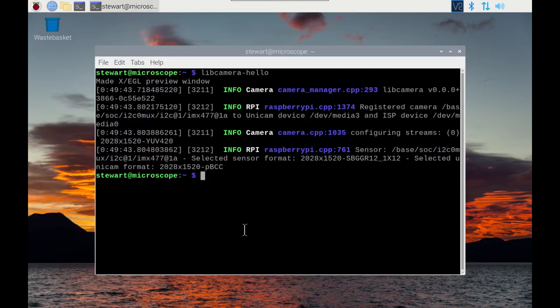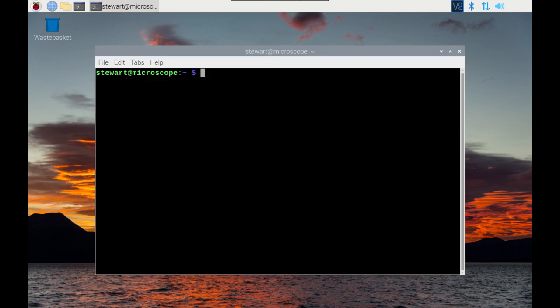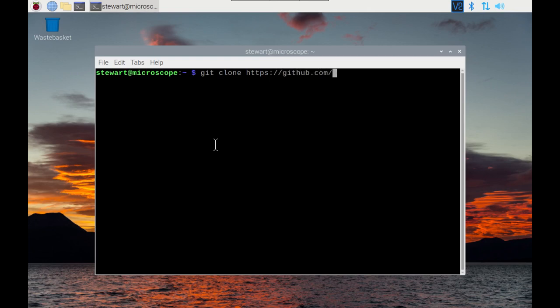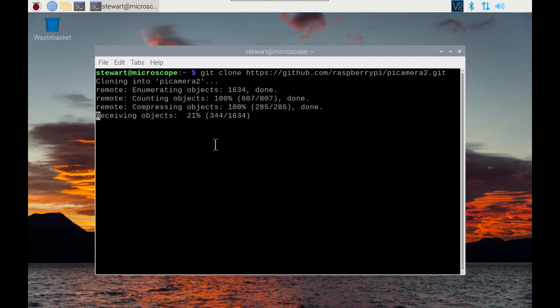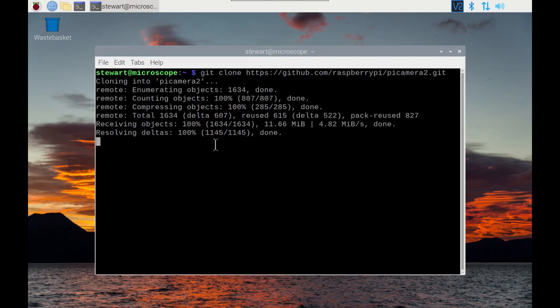I'm now going to download some of the example software. It's available on a git repository so we can just use git clone https://github.com/raspberrypi/picamera2.git and this is going to download it all into a directory called Pi Camera 2.